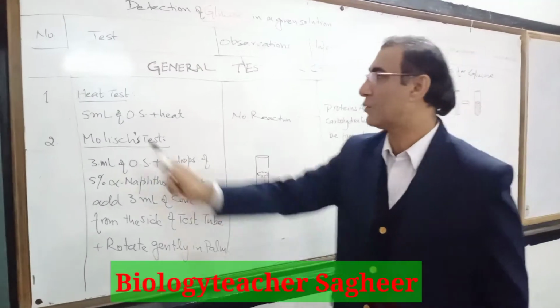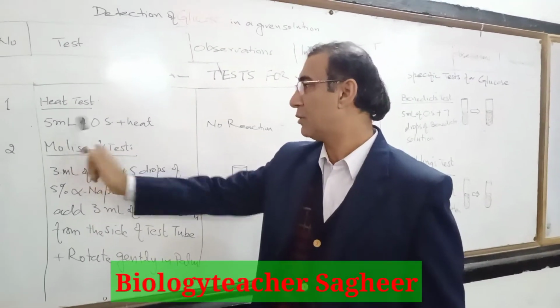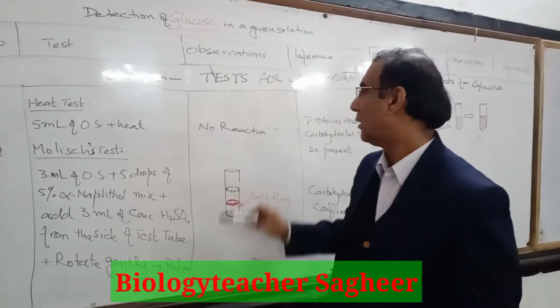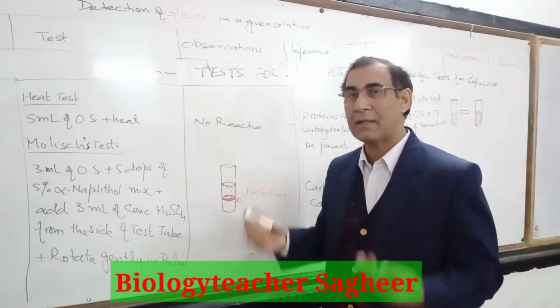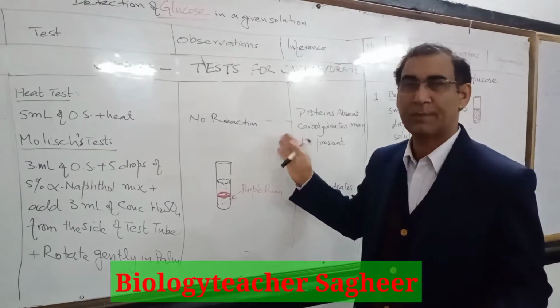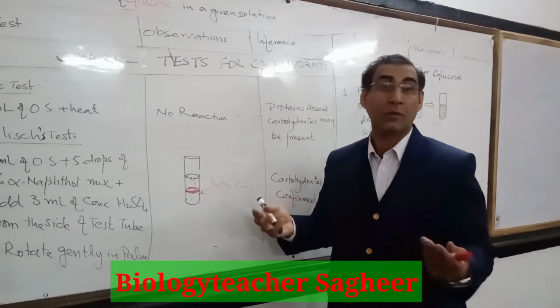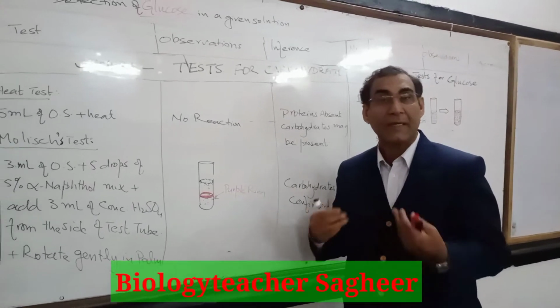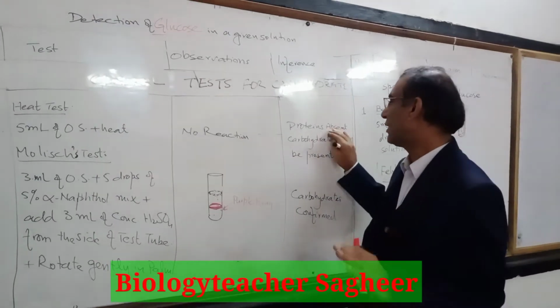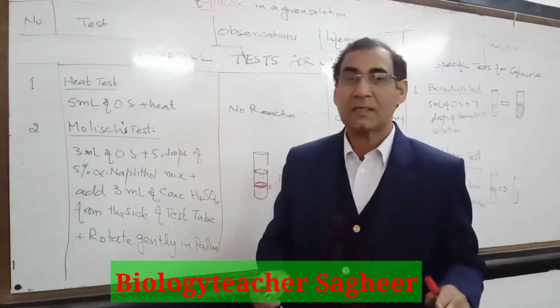The first general test is the heat test. Okay, you have to take 5 ml of original solution or the given solution, and you have to heat it. If no reaction takes place, it means either lipid or carbohydrate or even simple water could be present in that very solution. But proteins are absent. Absolutely, proteins are absent. When the proteins are heated, PPT are formed. So if no reaction takes place, it means proteins are absent. Carbohydrate may or may not be present. Next test is carried out.